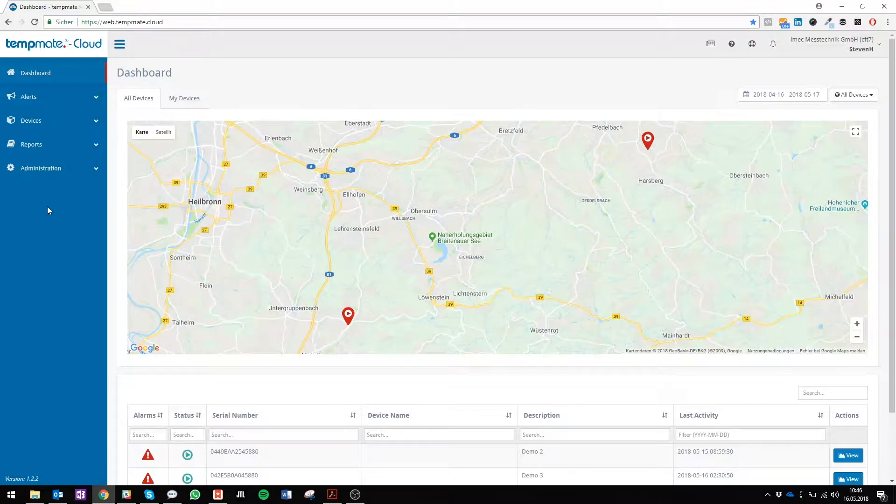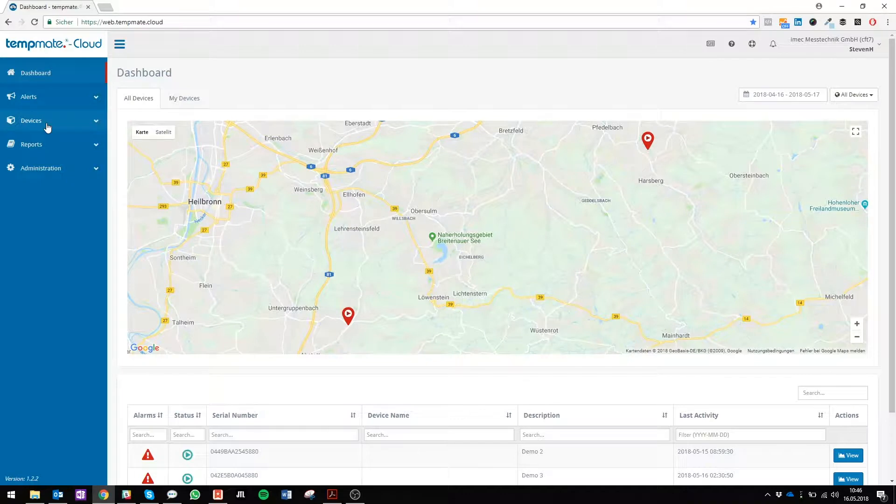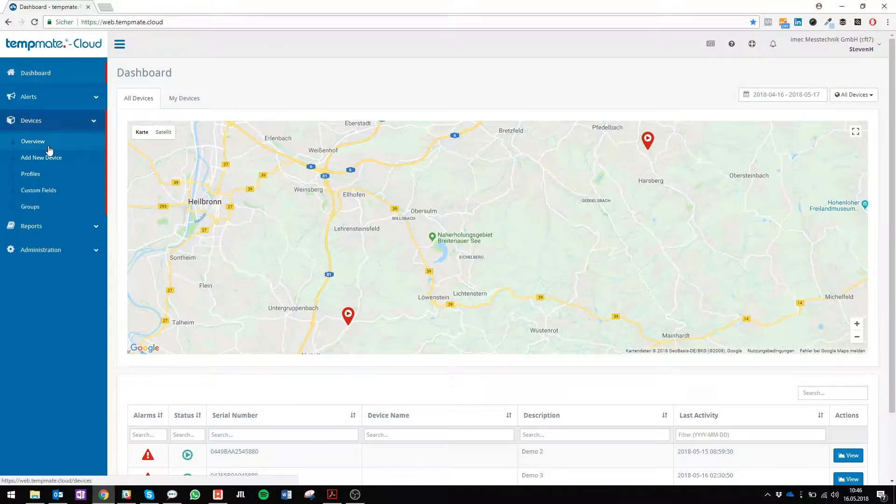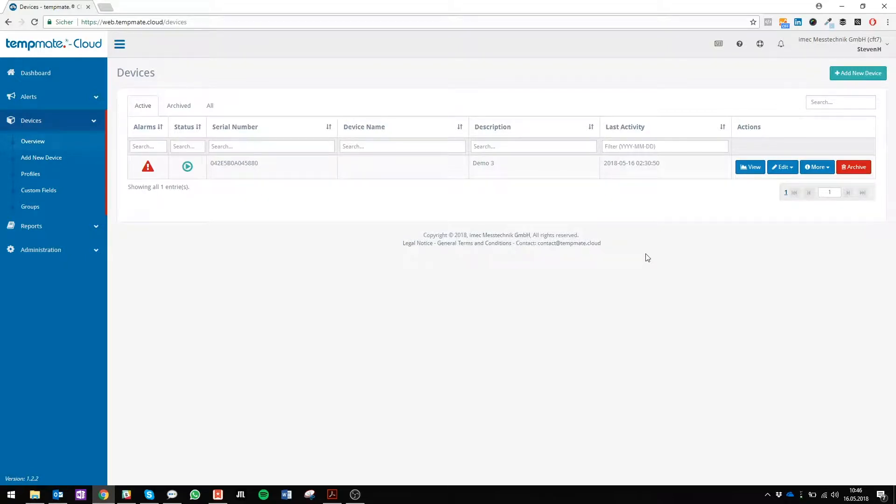If you want to analyze your data, first you go to devices and click on overview. Here you can see all your devices that are running or not running.